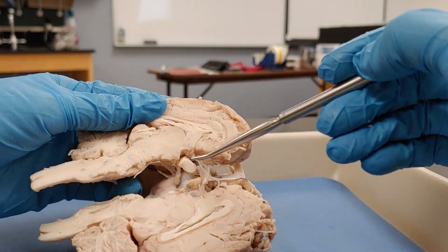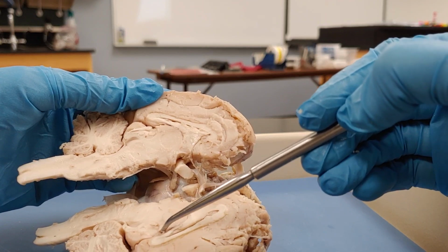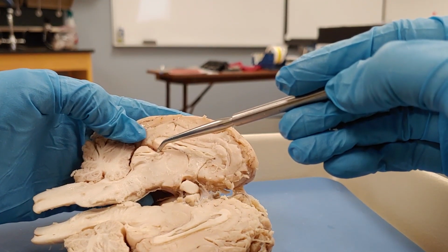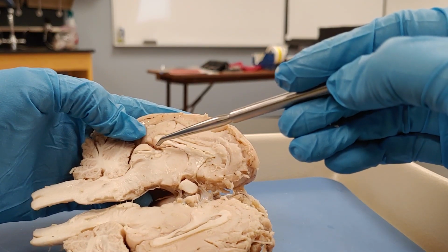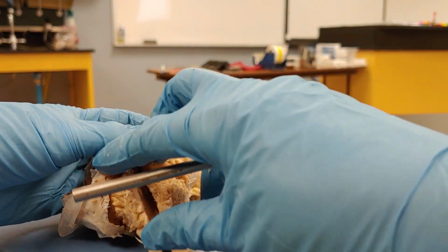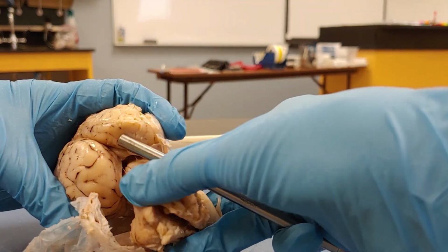Let's take a look at a few other structures. Let's see, I'm missing the pineal gland. Oh no, sorry, in this one it must have come out. So the pineal gland is the little ball that sits right here at the very back side of the thalamus, under the backside of the lateral ventricle. If you look, the other structure of the midbrain that you guys needed to look at were the colliculi. And you can see them here.